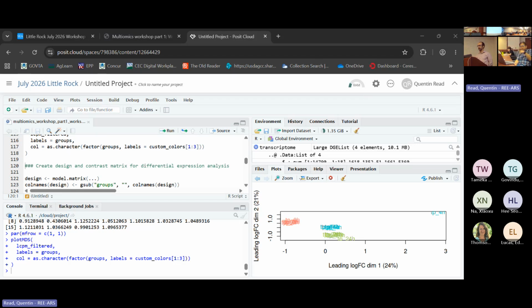Do you expect this to be the same for all of us? Yeah, it should be, yes. But mine is a little different, even though there's a separation. Yeah, it looks similar, but not quite the same. 32%. There shouldn't be any difference. Mine is different. Really? That's interesting. Is there some sort of random dimension? It's flipped. It's okay, the dimensions are flipped. It's a mirror image. Oh, actually, yeah, you have a different scale, I think.